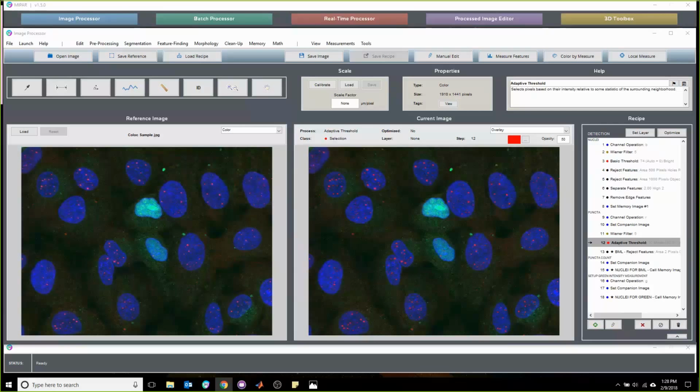And it's great to see it put to such important use, because the whole ICME effort, being able to predict in a computer how your material is going to behave given how it looks under the microscope, is a great new frontier. And you guys are even doing some stuff with genetic algorithms as well, I believe, a genetic algorithm and neural network coupling where they're checking against each other to verify that our models are accurate.